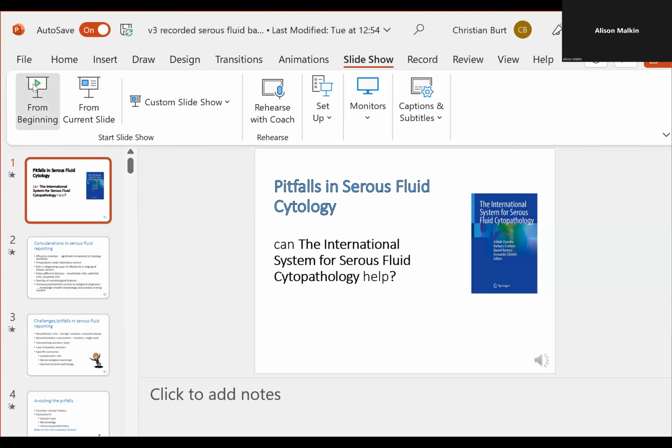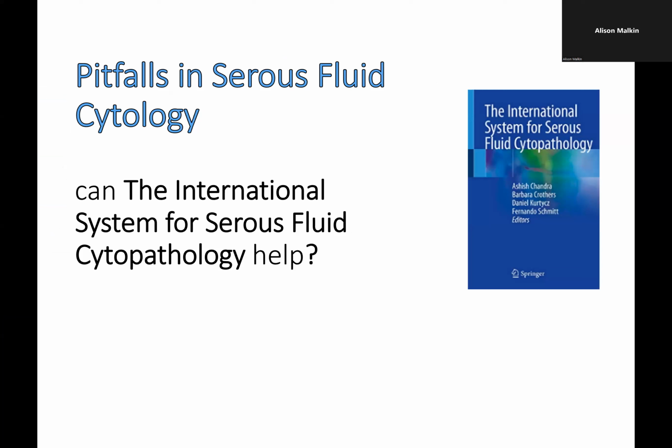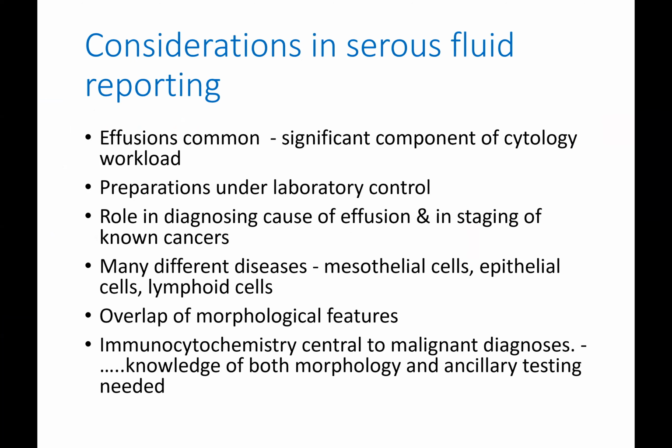The second part of my talk is on pitfalls in serous fluid cytology, and can the International System for Serous Fluid Cytopathology help? Effusions are common and certainly comprise a significant component of many cytology lab workloads. The preparations are under laboratory control as the samples generally come in a pot, which is useful. Serous fluids play a role in diagnosing the causes of effusions, but also in staging of known cancers.